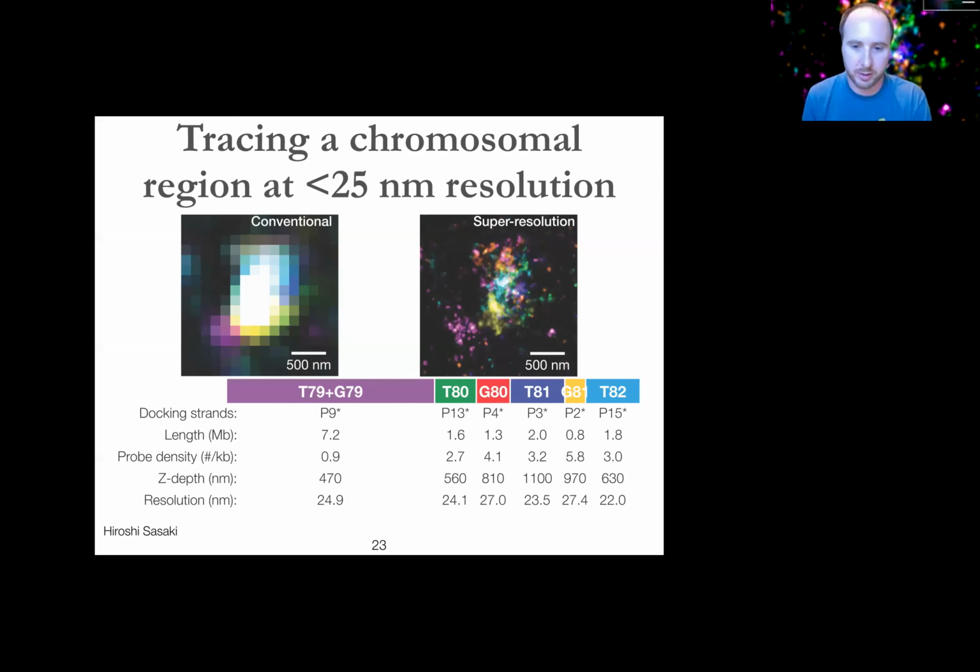To put a little bit more context into that, here are some of the quantitative numbers we're able to extract from this imaging. This is just a simple summary we can get. There's many more advanced ways to analyze these data, but just as a zoomed out view, we can look at, for instance, what our effective resolution is. And in this experiment, we are getting on the order of 20 to 30 nanometers in the lateral dimension. With different optics, you can probably cut that in half. But with the optics we use, those are the numbers we got.